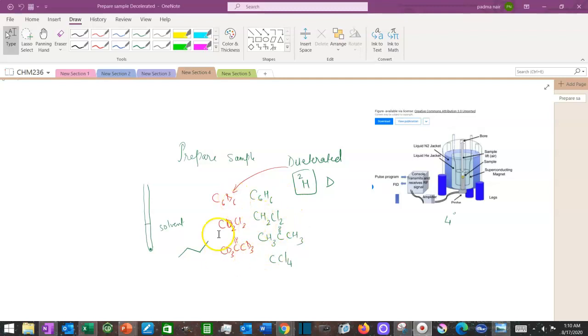So we use deuterated solvents, where the proton is replaced by the deuterium isotope of hydrogen. Deuterium also has a nuclear spin, but it absorbs radiation over a very different range of frequencies than protons do. Therefore, these can be safely used as solvents to detect the structure of your molecule.